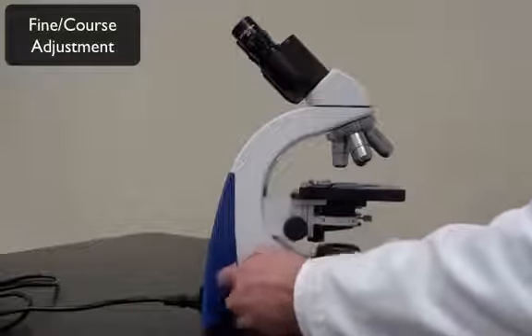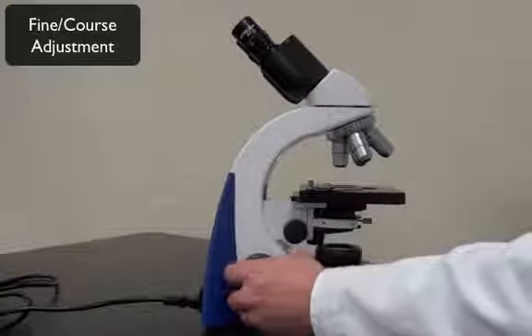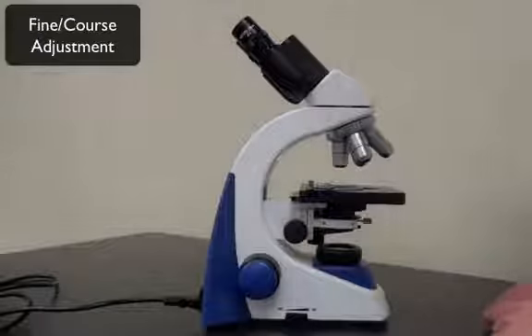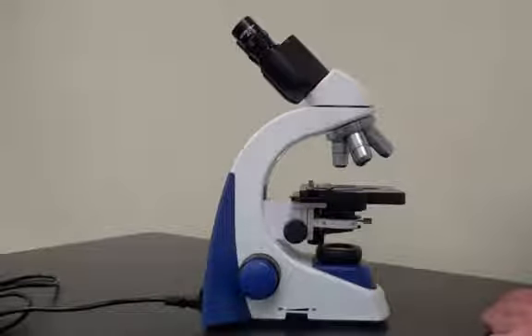Okay, so you've got to be careful which adjustment you're using when you're under a certain objective lens, and we'll talk about that in part 2 of the video here. So hopefully this gave you a better overview of the microscope points and parts for when we go through how to use the microscope.